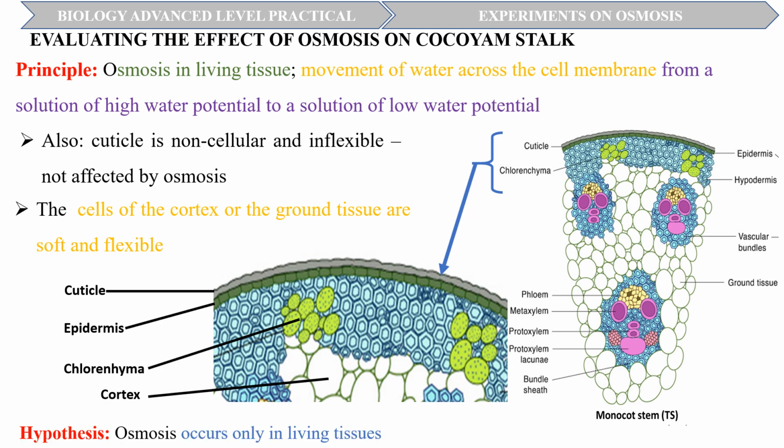As hypothesis, we can say, osmosis occurs only in living tissues and not in dead tissues or non-living matter.